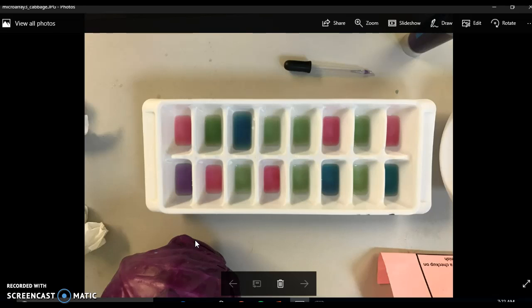potentially might be easier for students to identify which genes are active, inactive, or normal functioning. And this data, of course, will then be used for the next step of the lab, which is reporting on which genes are active, inactive, and normal functioning. And it gives you an opportunity to test whether the cabbage version gives clearer results.